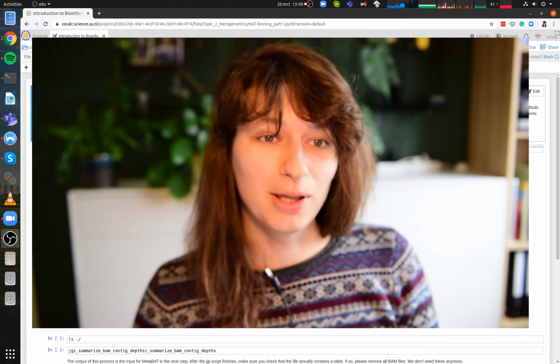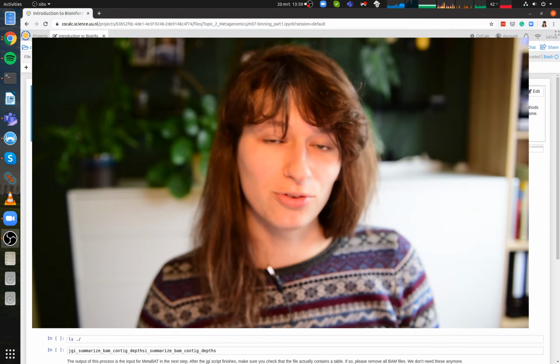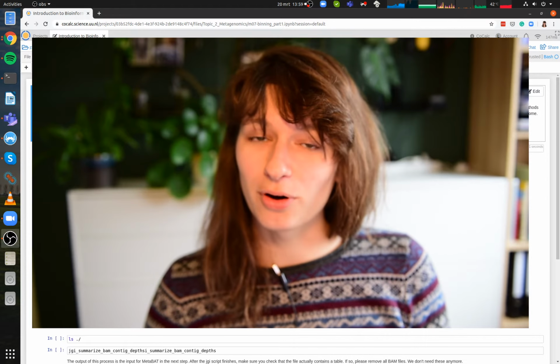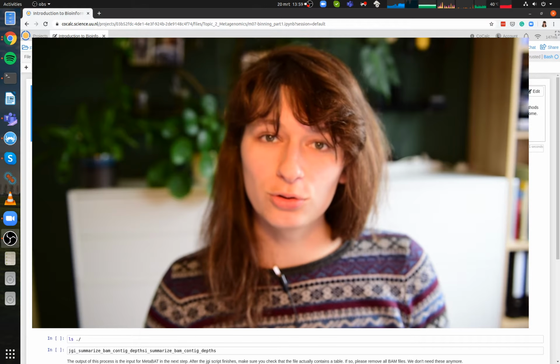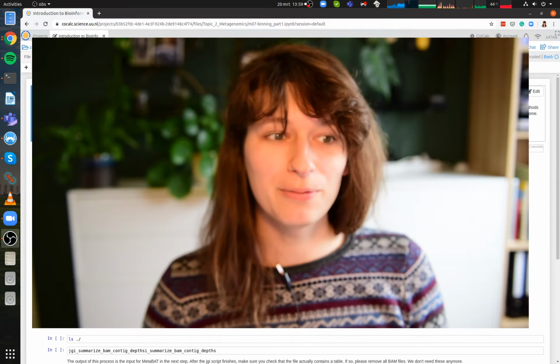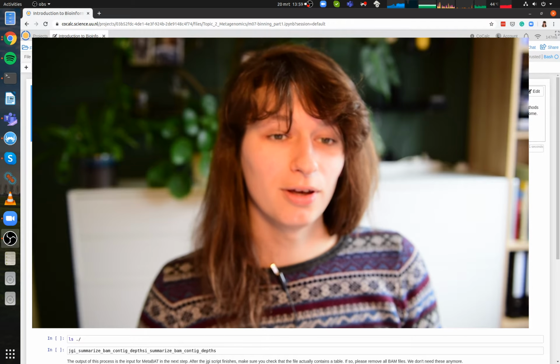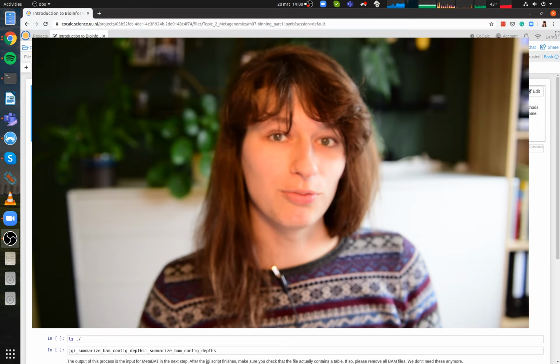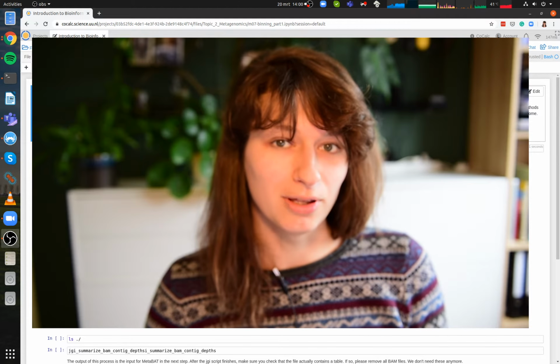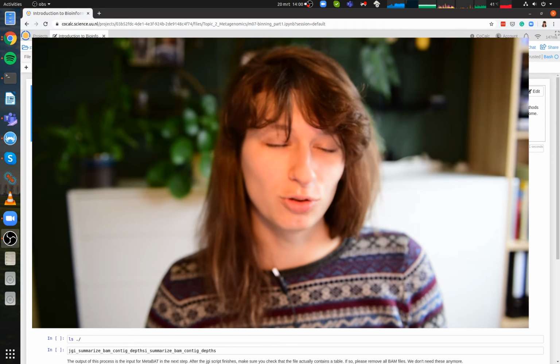We're ready to start with the binning process. And this is the first part in today's practical where we really differentiate from the genomics practical of the day before. Remember, in topic 1 you also used BWA to map DNA reads back to an assembly. You also sorted these BAM files, but today we're using these BAM files to differentiate multiple genomes within that assembly, instead of variant calling like we did yesterday. So real metagenomics happening here.